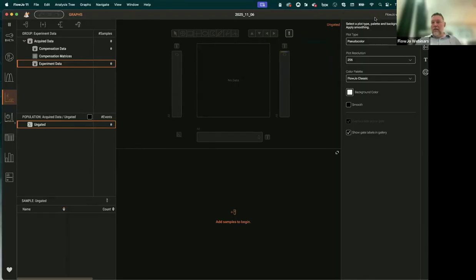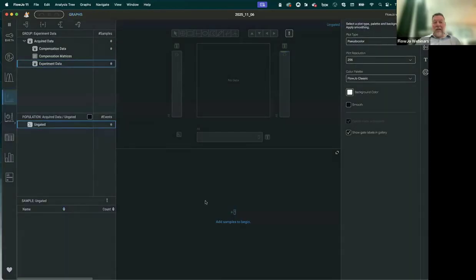I'm going to minimize myself maybe, so I can see everything that's going on. All right, I'm just moving some bars here. This is my workbench. I am using, under the View tab, the theme for Tangerine, which is kind of cool, but maybe you want to do Amber. Maybe you want to do Madison. I like Madison. That's a good looking theme in my view. So I'm going to stick with that one.